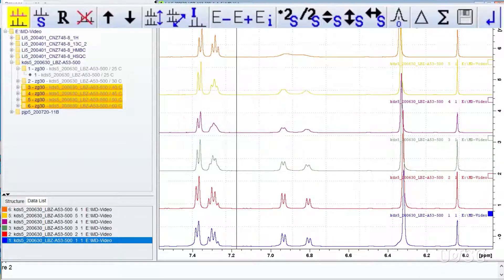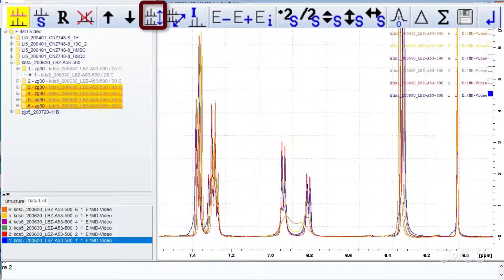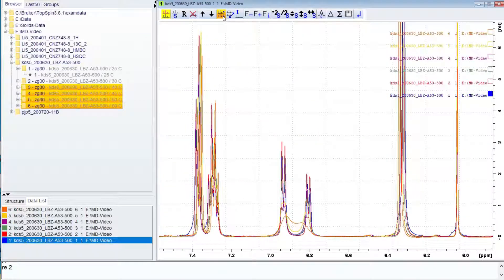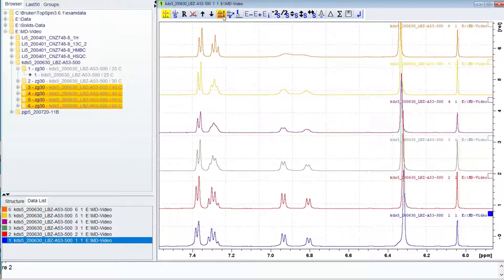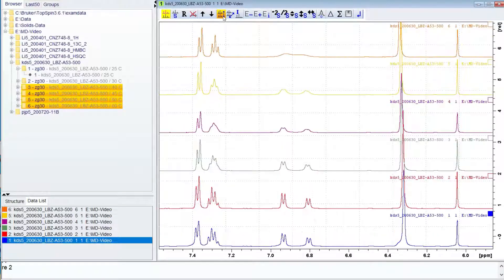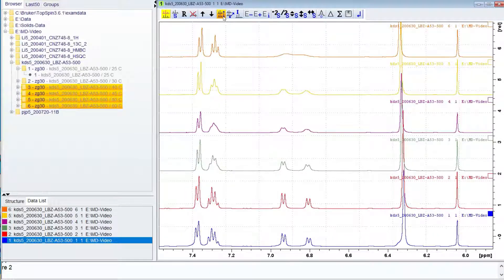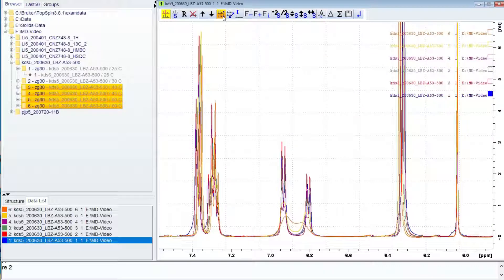The toggle display button will change the offsets that each spectrum has in the display. The initial vertical offset is calculated to fit all the spectra. With the default values, it will toggle to no vertical or horizontal offset to give a true overlay.